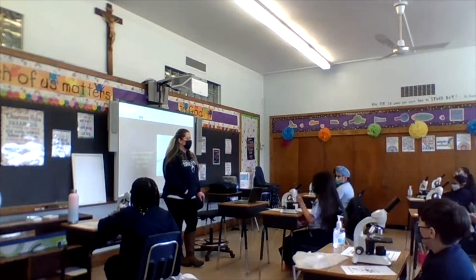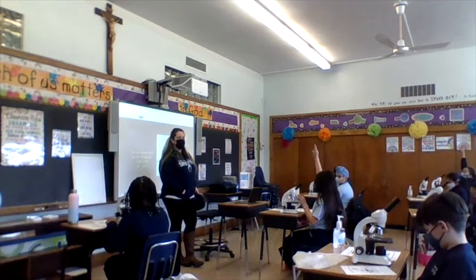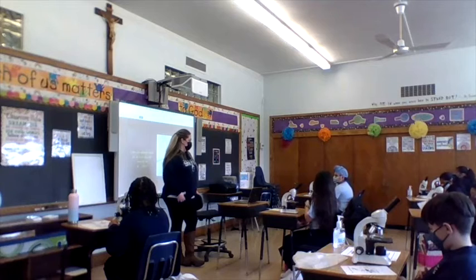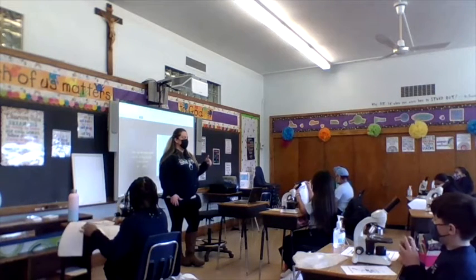What are we going to label on our worksheet in our microscope packet? Brianna? Yeah, high five this guy. Good job. You're going to label the parts of your microscope now.